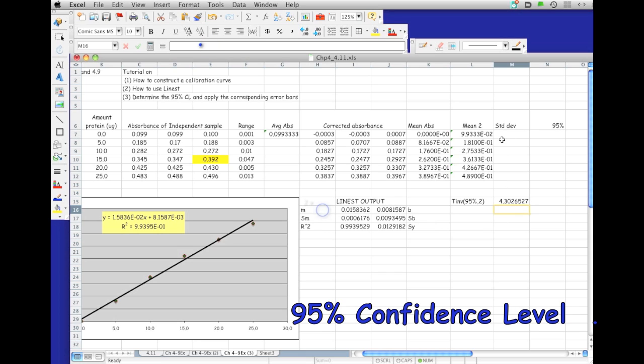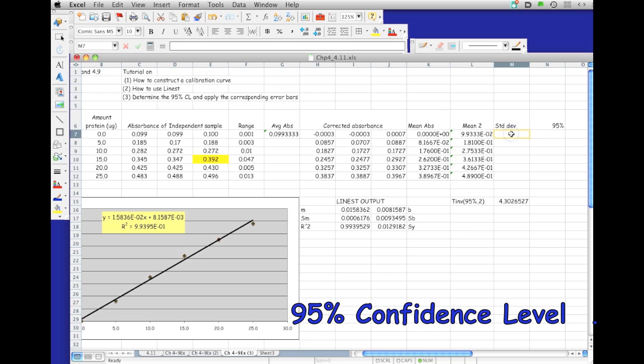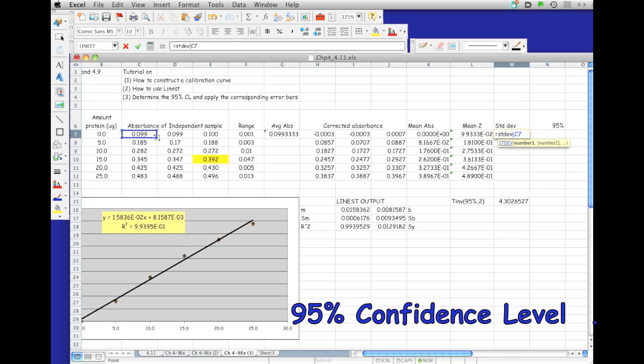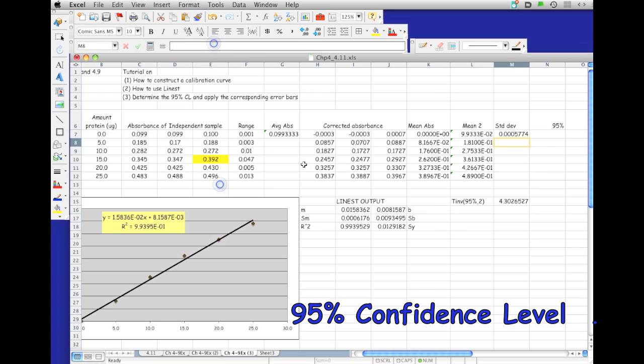The other thing we want to do is figure out the standard deviation. Remember that we're taking the average of these three independent absorbances. We're going to have a standard deviation for each one of these. That's just equal to... we're just going to highlight these. That's going to be right here.